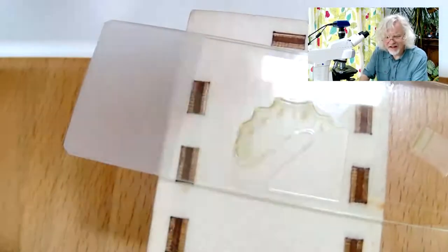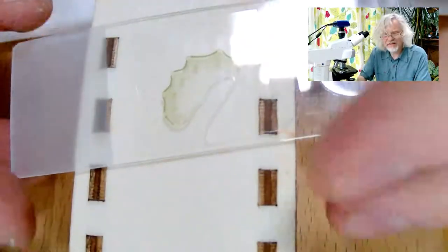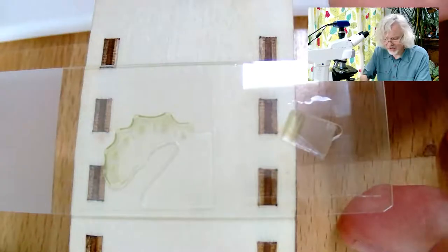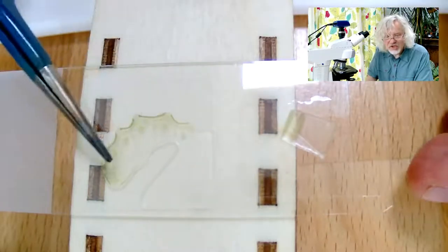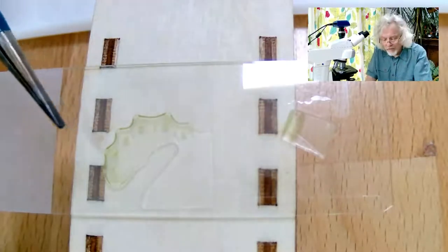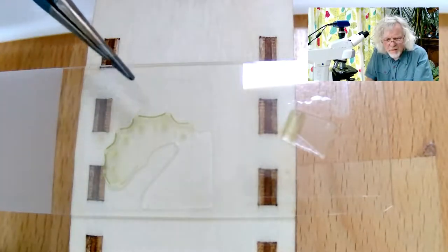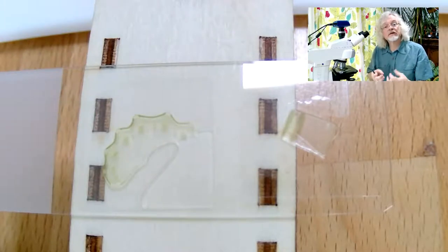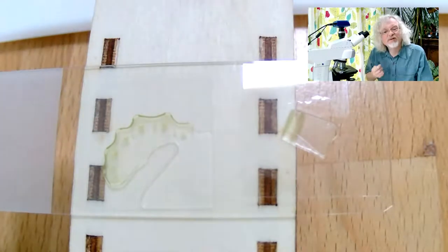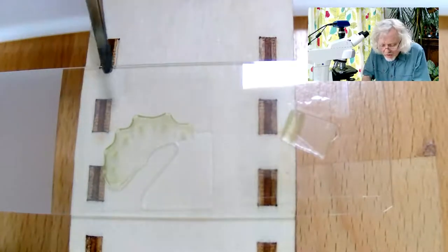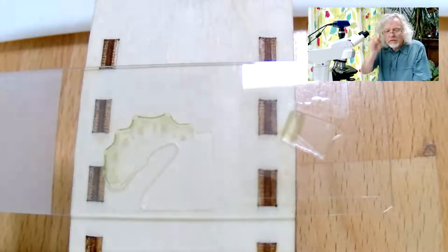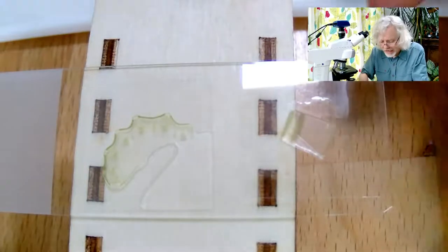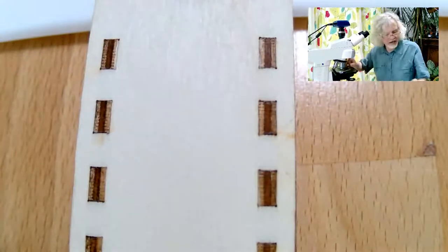So if I put that there and then focus on that, like that, you can actually see quite a lot of detail. You don't even need a microscope to see quite a lot of the detail here, but just to sort of orient you. So I've got here a tiny little slice of the leaf stem. You can see the outside. That's the epidermis. That's where it's green. And then you can see these little bundles. Those are the strings that are inside that you sometimes pull out. They're called vascular bundles. But there's also a stringy bit right at the corner of each of these sort of nodules where it rises up.